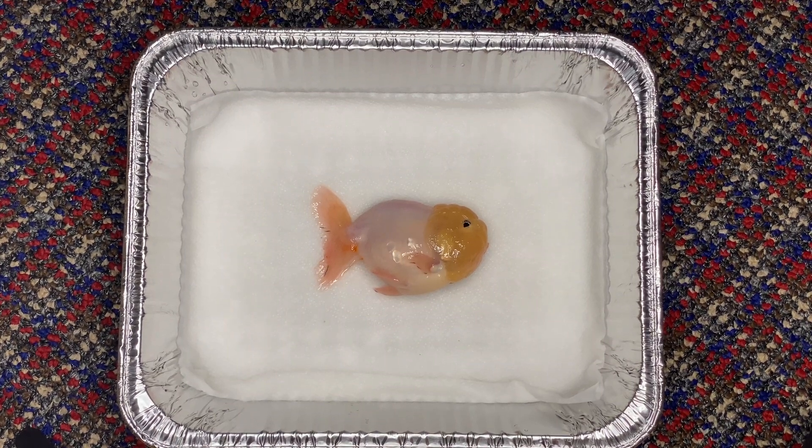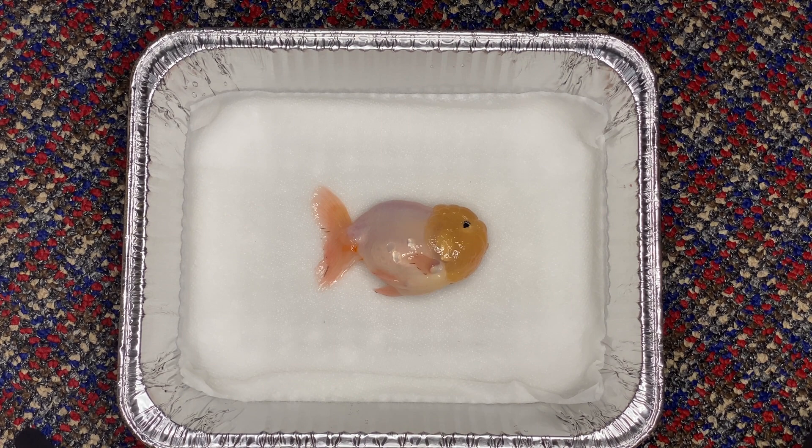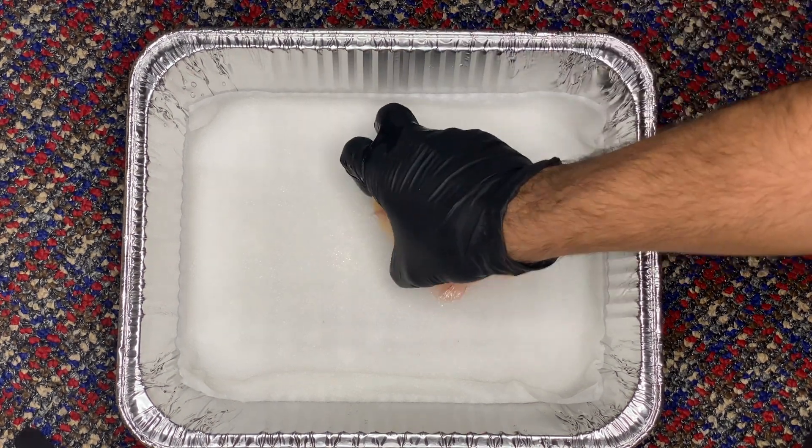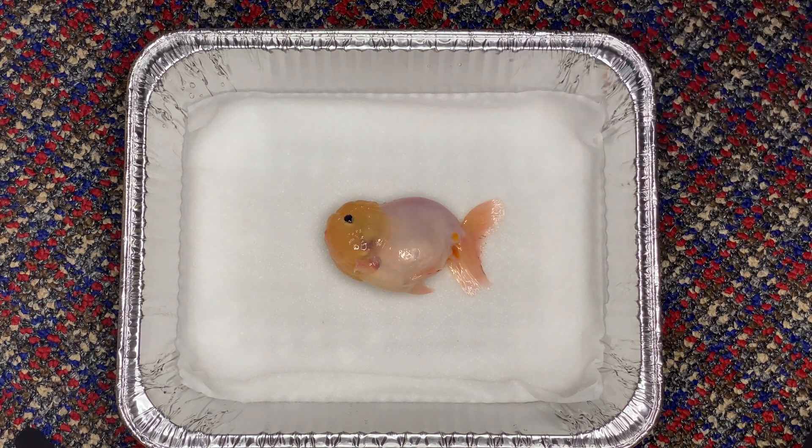Alright guys, so just a warning ahead of time, this will be a very gory and very graphic video. I will be doing a little dissection, just showing the organ placement of my deceased goldfish, Georgie. I had to euthanize him yesterday. This is a video I took right after euthanizing him because I wanted to show what everything looked like fresh, basically right after the goldfish died, before any rotting or decomposition took place.